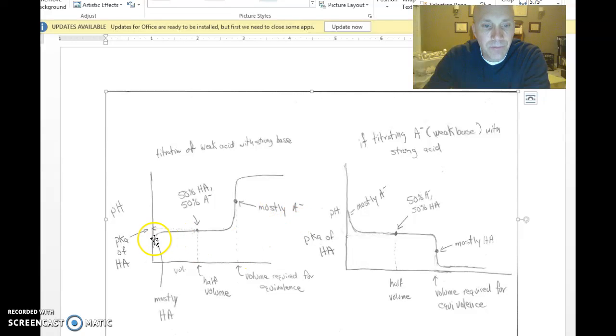Hey, so I'm making this video as a little guidance in the lab that we're doing. We've done titrations of weak acids with strong bases before, and this is definitely the type of pH curve that you're probably more familiar with. It goes kind of like this, where by now you should realize we go through this region right here, which we call the buffer region, and we hit that equivalence point.